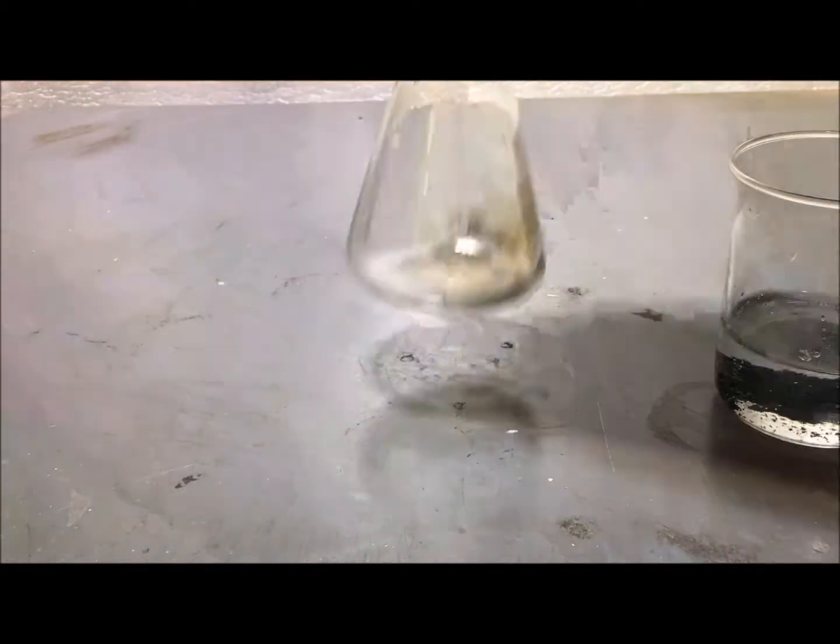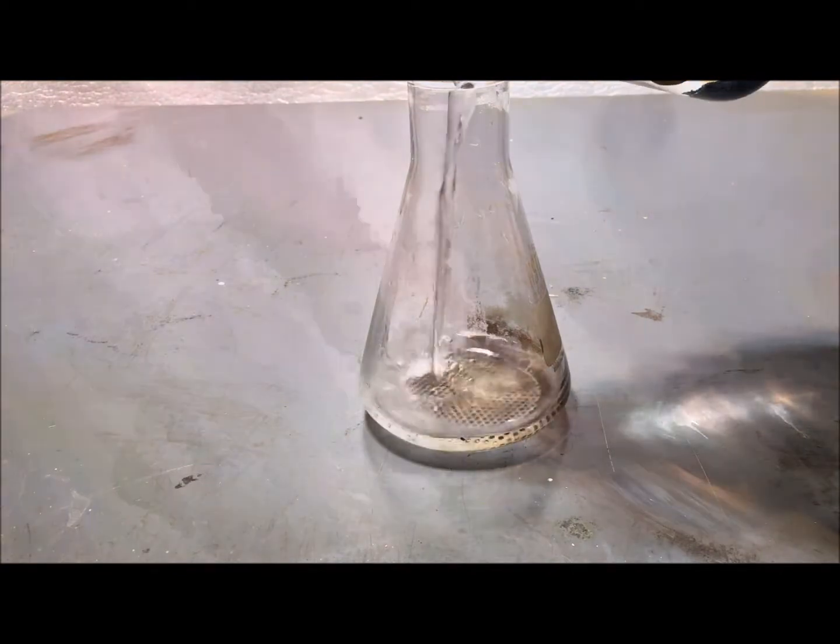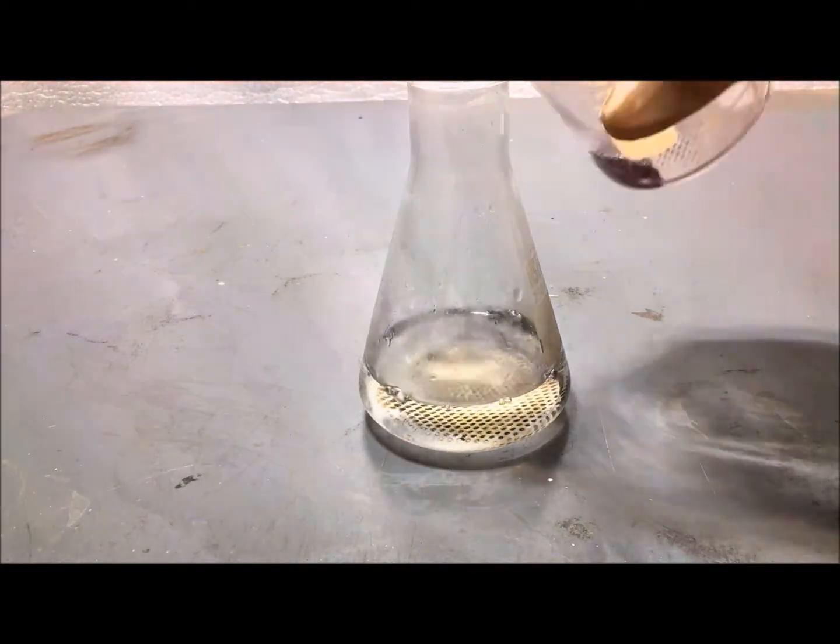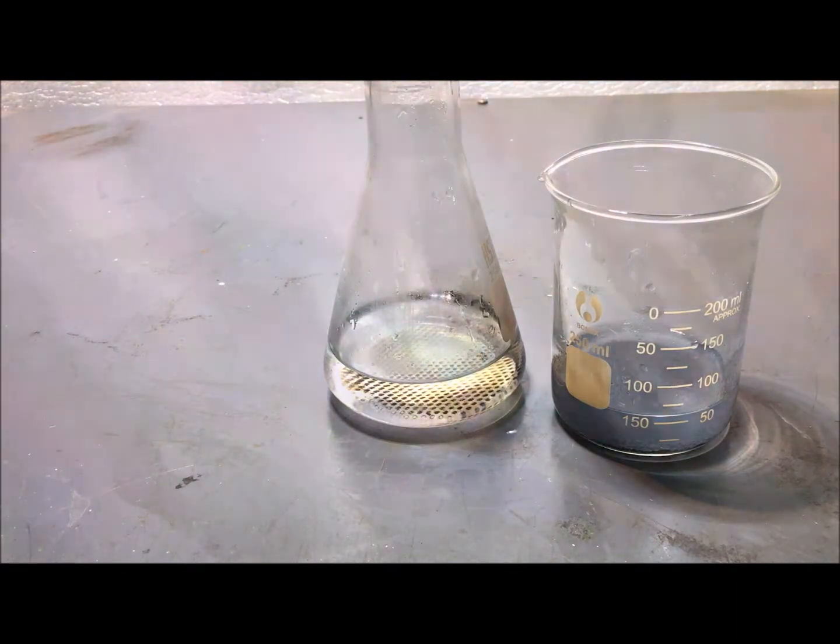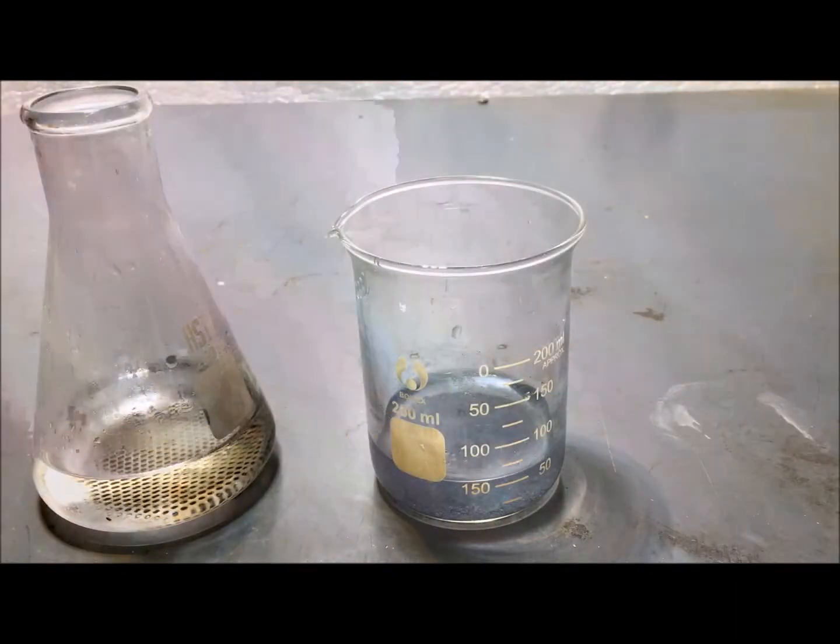After some time, you will see the zinc metal deposited onto the carbon electrode. You might want to agitate the solution, because once enough zinc is deposited onto the electrode, production seems to slow down a lot.